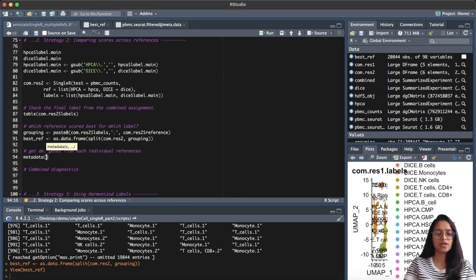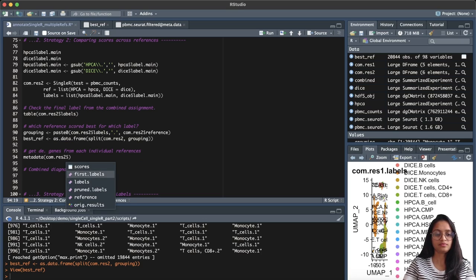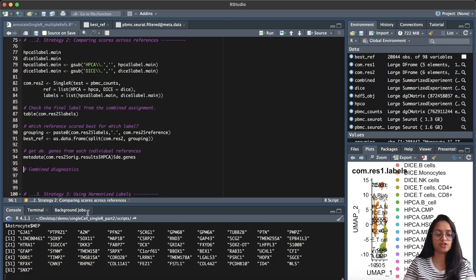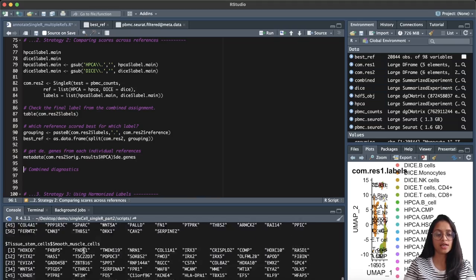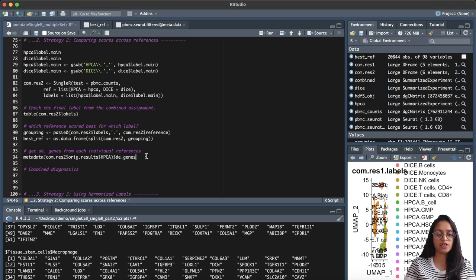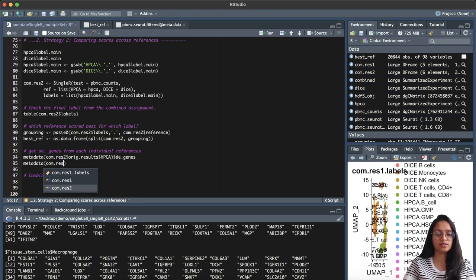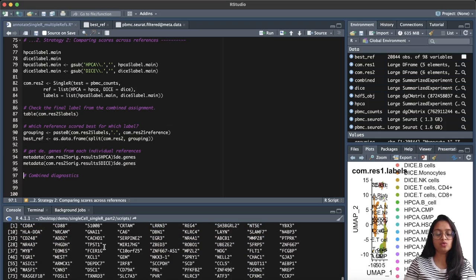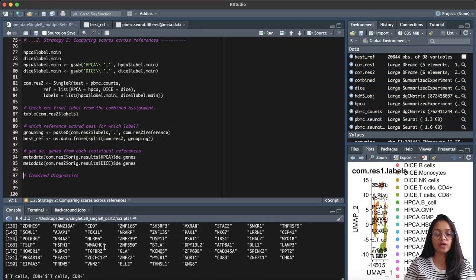It is also possible to get the marker genes for each individual cell type per reference. We can get that from the original result by accessing the differentially expressed genes, which gives you the markers for each cell type from each reference. Similarly we can get the same information for the DICE reference dataset. This information can be used for further detailed diagnostics, troubleshooting, or further analysis.